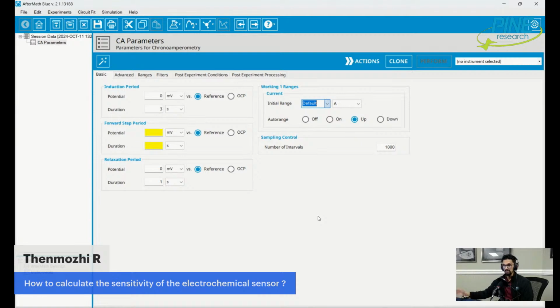So maybe you can hit 1 part per trillion, but your instrument couldn't fundamentally get to 1 part per trillion because it would require picoamps or femtoamps of current, right? It actually has to measure a very, very small amount. So that's another thing that you should keep in mind while you're trying to determine the sensitivity. But I think sensitivity levels are usually described as parts per million or parts per billion. So it has a detection limit or a sensitivity of 5 parts per billion. It's like it can detect that much lead accurately.